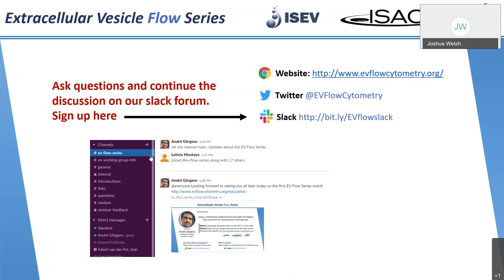So a pre-gate using these roundness features and so on would mostly rely on bright field or scatter images. For cells, you can nicely separate a round cell from an elongated cell, for example, and then it makes a lot of sense, if you're interested in that, to pre-gate on these. We are not pre-gating on any bright field or shape parameter. We are mostly interested in the ones that are scatter low and devoid of bright field and scatter. Otherwise, for the single EV detection, it's a bit more explained in that paper, but I think it makes more sense to directly go for fluorescence.